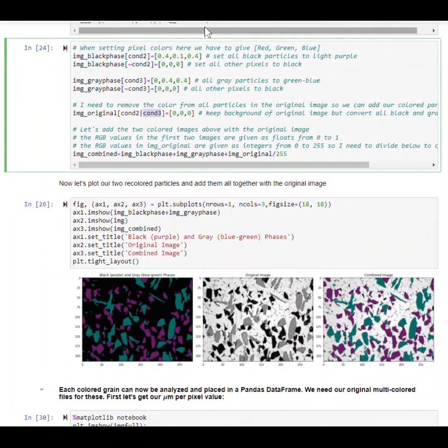And I'm doing this so that when I add these pictures together, I'm going to add these colors onto essentially the black areas, which are zeros, and that's how I transfer my color in. If I left this as white, I'd be trying to add these values to, say, white areas at 255. They're already maxed out, and so they would just stay white. I wouldn't see anything. All right, so that's what we're doing there.